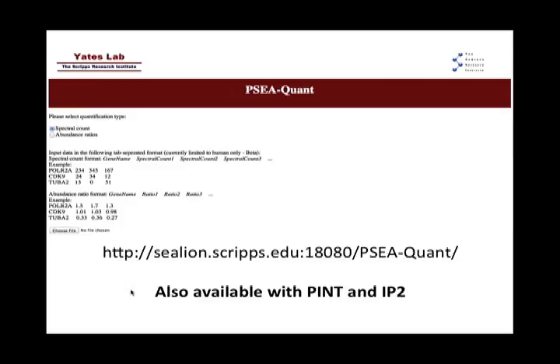So we're looking at different strategies that have been proposed, and our goal is to either integrate one of them or design something inspired by the work that was already done, in order to provide a more intelligible output for PSEA-Quant. We are also, as I said, looking at the addition of more organisms for PSEA-Quant analysis, so E. coli and zebrafish.